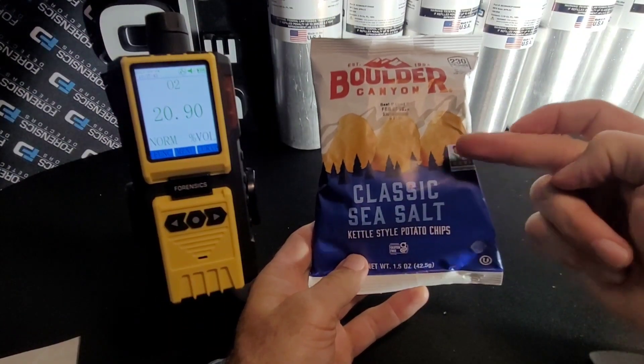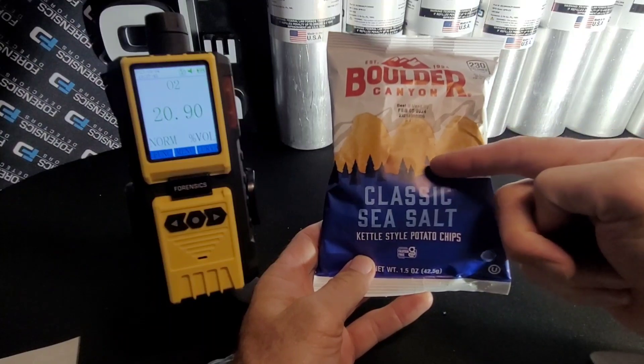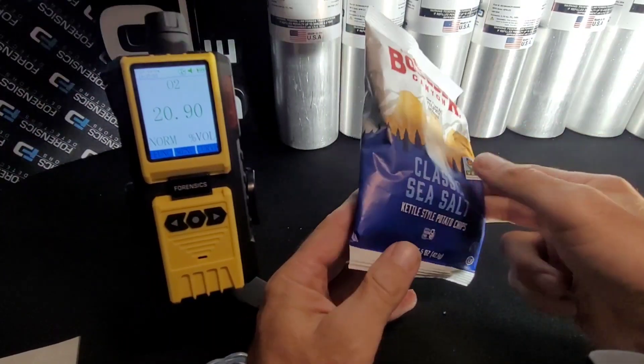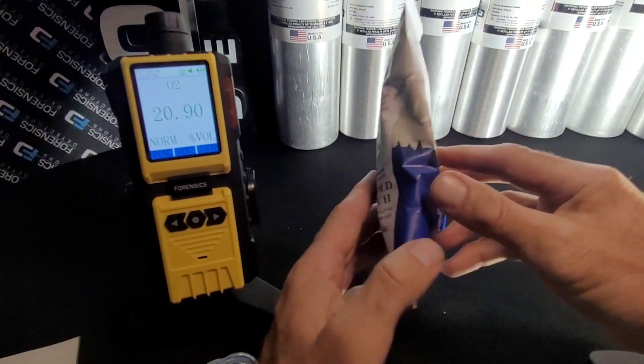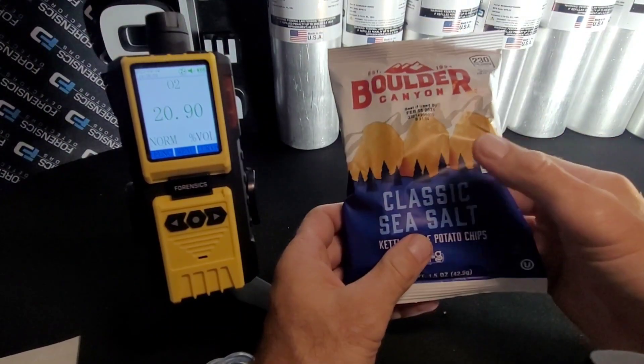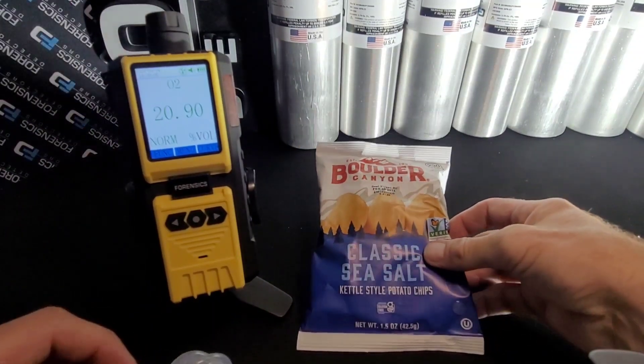As we know in headspace analysis, we're doing a gas flush of nitrogen — or it could be carbon dioxide with nitrogen, some ratio. We want to make sure the bag has been flushed and there are no pinholes or any leaks coming from poor packaging. Headspace analysis can confirm that.